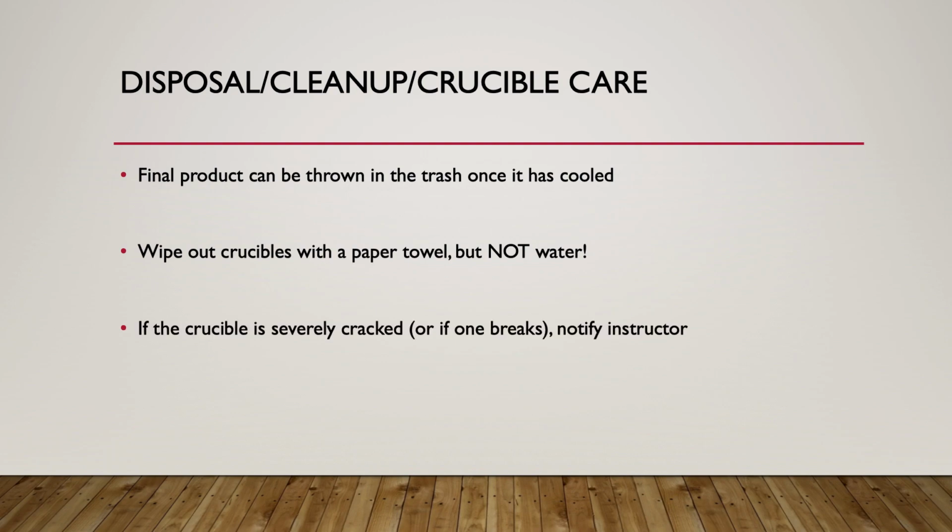Now, one thing that will happen in this experiment, crucibles will crack and break. Obviously, that can happen through just being dropped or error on the student's part in handling it. But it can also just happen in the normal course of heating and cooling something made out of ceramics over and over. It's going to break over time. That's just something that happens to these crucibles.